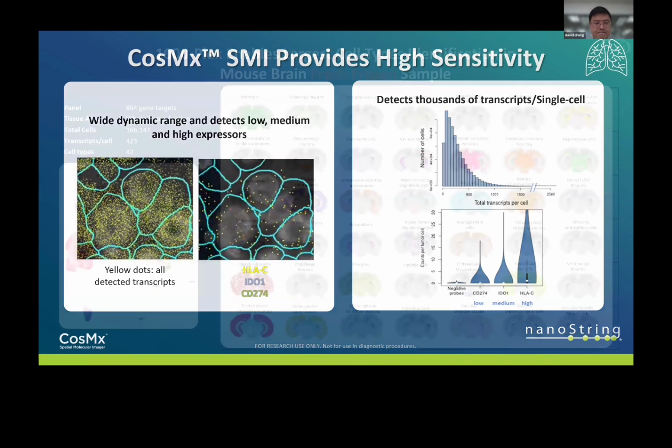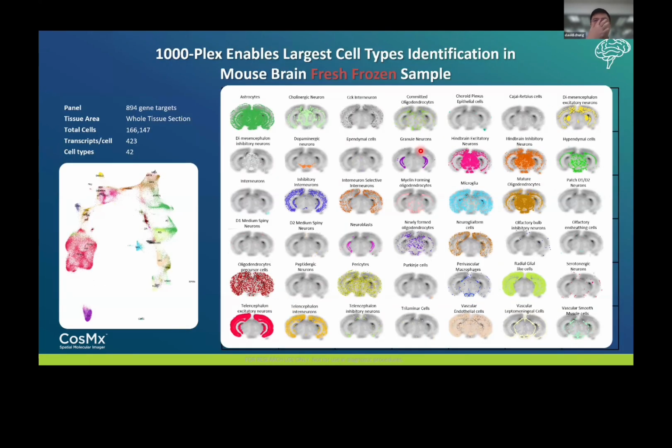So if you have been working with NGS, you're probably familiar with this t-SNE plot, in which, based on the data collected from the tissue section, the plot can help to identify and isolate the different abundances of different cell types present in the sample.